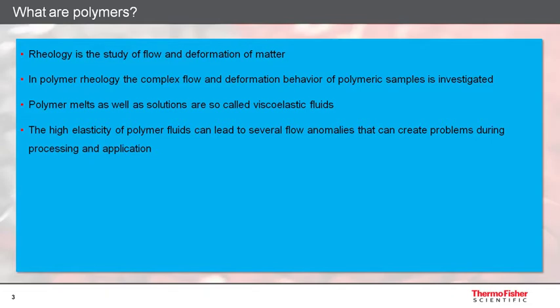Rheology is the study of flow and deformation of all kinds of matter, and polymer rheology deals with the investigation of the complex flow and deformation behavior of polymeric samples. Polymer melts and polymer solutions are so-called viscoelastic fluids, which means that they have viscous as well as elastic properties.